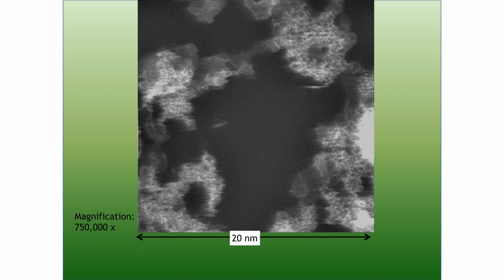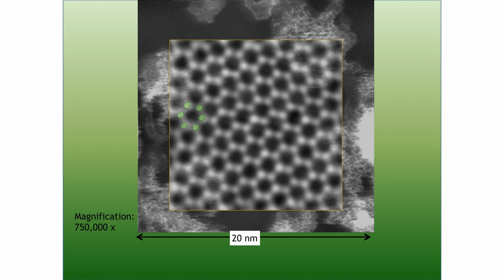But if we then zoom into a clean region, we can actually start seeing a background pattern, and there we see it, atoms. This is the lattice of graphite or graphene, and we can see the atoms are actually spaced at 1.5 angstrom.